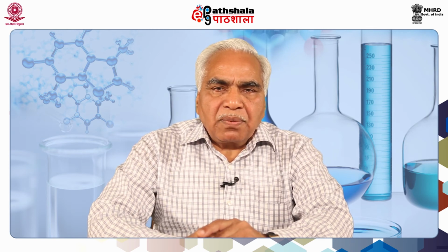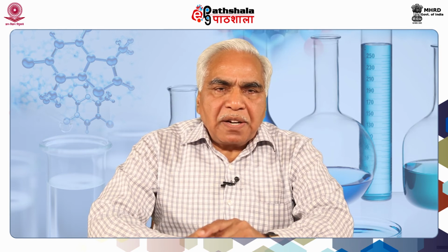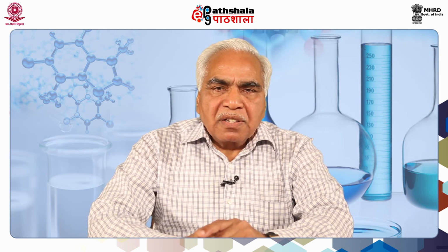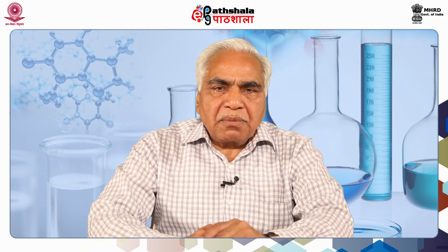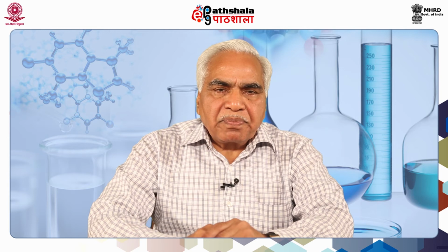Preparation of sample for scanning electron microscopy is important. Sample preparation method will also be explained. There are several applications, advantages, disadvantages and limitations in scanning electron microscopy. These aspects will also be covered towards the end of my presentation.